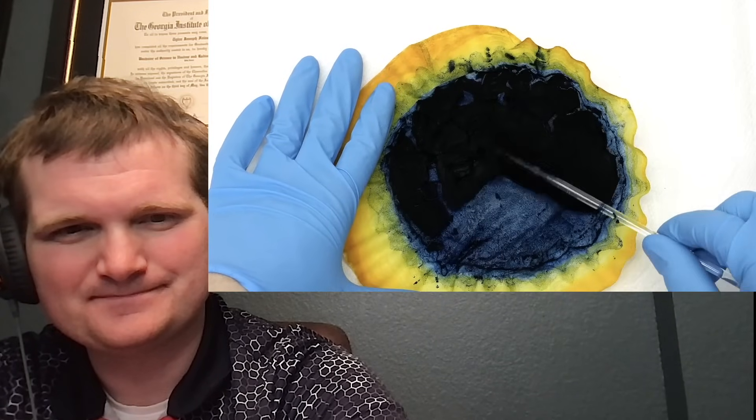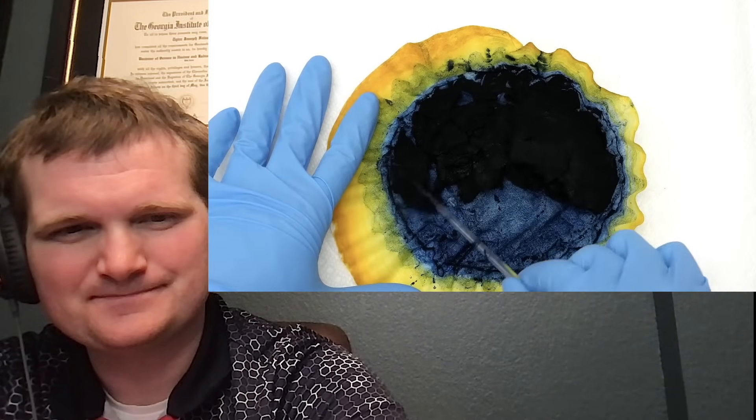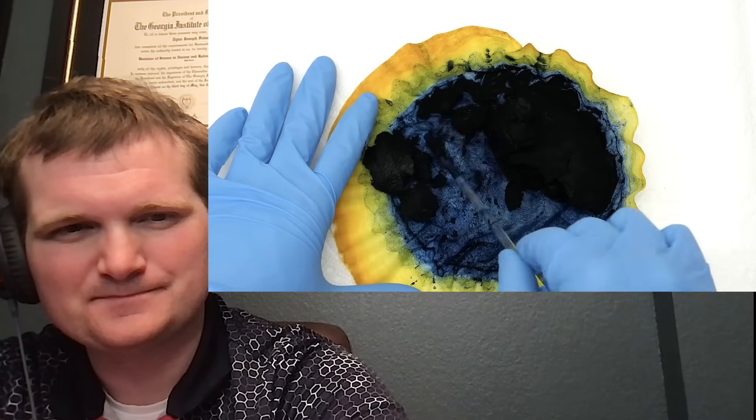This video is going to be the first in a series of three, and for this one I'm going to be focusing on making and isolating the pigment.